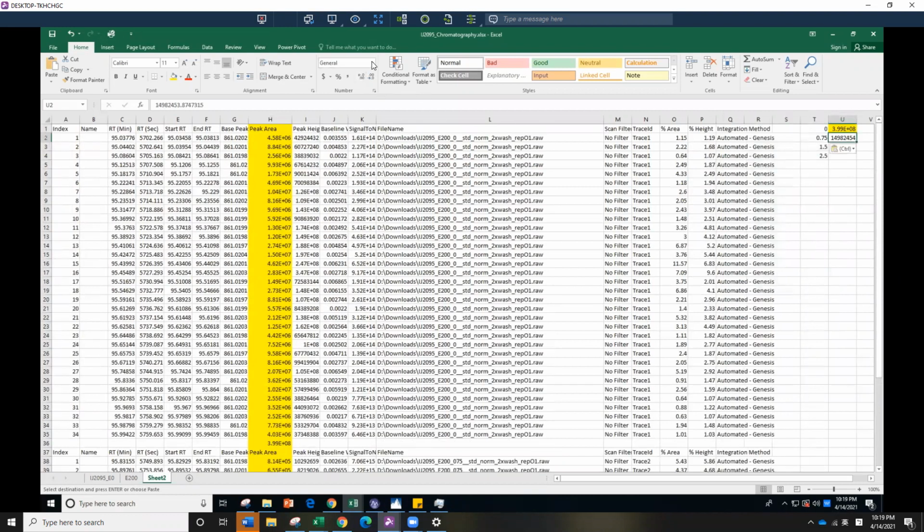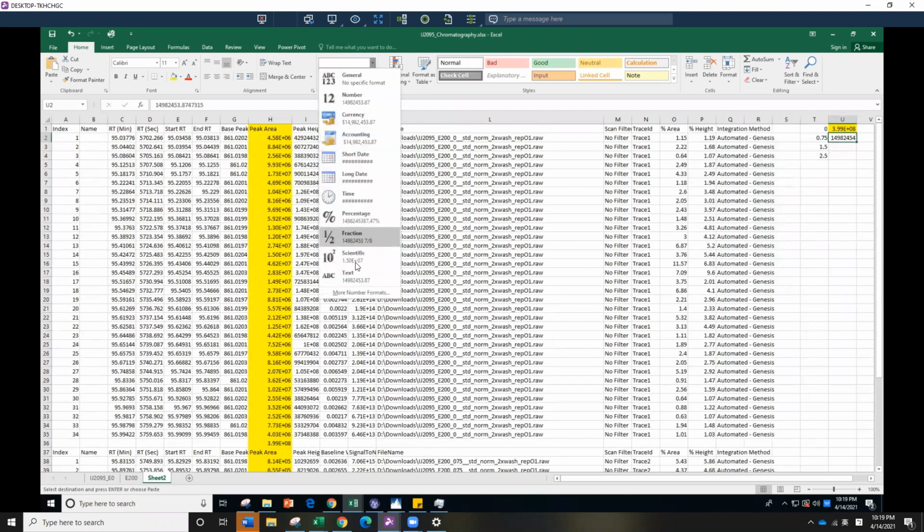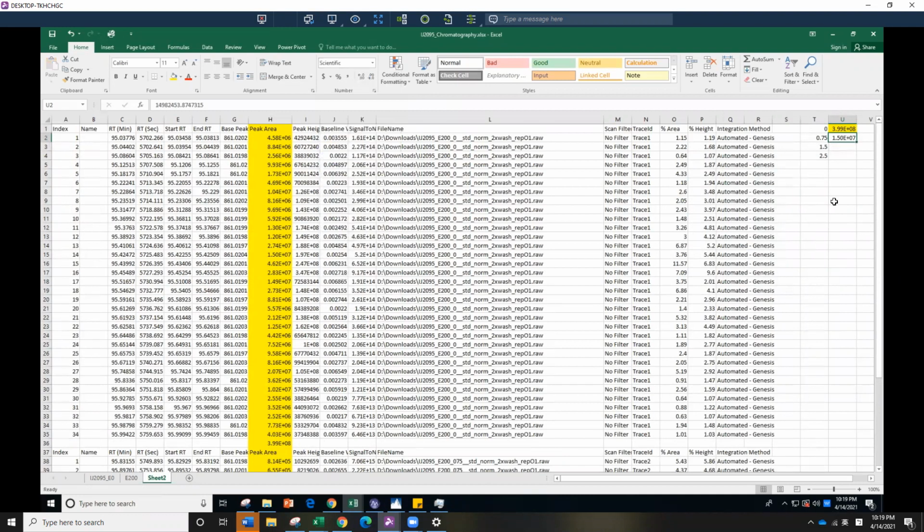Yeah. So that is how you're going to extract chromatography, how you do the quantification using MS1 instead of identification. So you can see it's a really lengthy process, because we're going to find a couple of peptides, a couple of the sites we're interested in, and you're going to go through this kind of manually. So we will need to find a better way, but it's a good start. So I hope that helps.